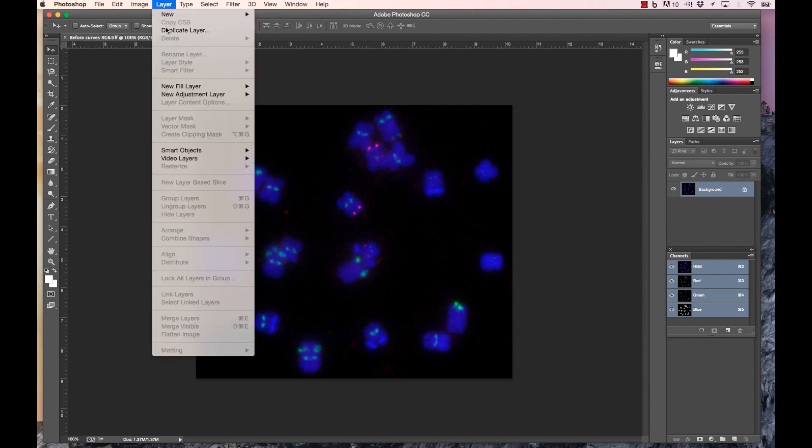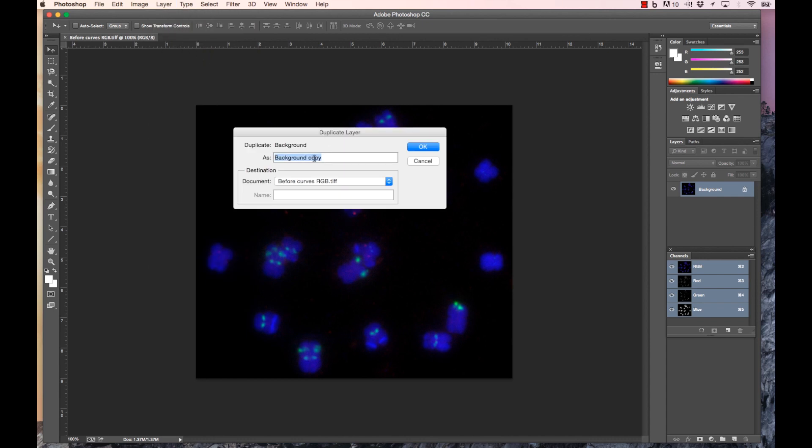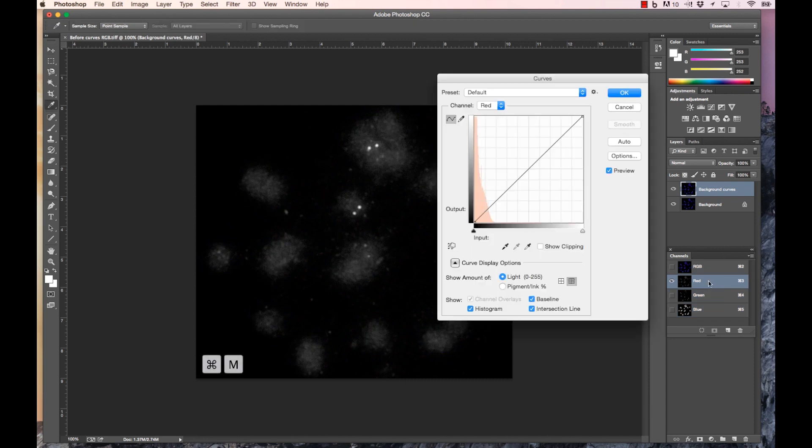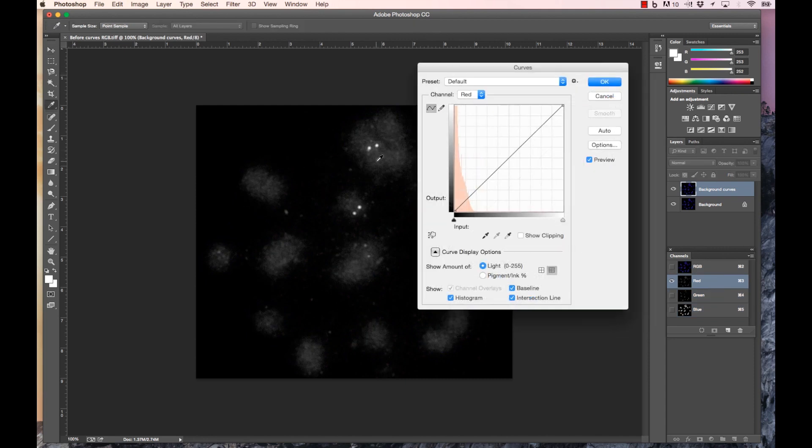To proceed with signal modification, a copy of the image is made by adding a duplicate layer, here renamed as background curves. With the red channel selected, the curves window is opened and the signals of interest are located.